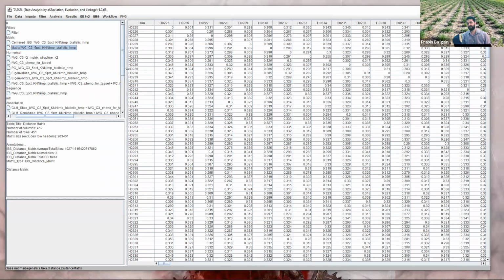Maybe the error will be when you try to use the distance matrix as a covariate in your MLM model in TASSEL, it will say no. I have reported distance matrix in the past, mainly because it was very easy to do using the VCF file. There's a program called VCFtools. I did it fairly easily on the MSI, so I don't have to play with it later. But if I had to take a guess, I think they're very similar. Maybe others in the group have some experience. I don't do much genomic distance, only kinship and PCA. Yeah, thanks.